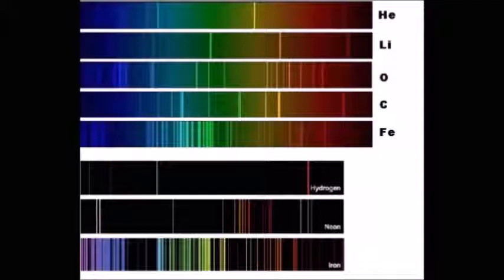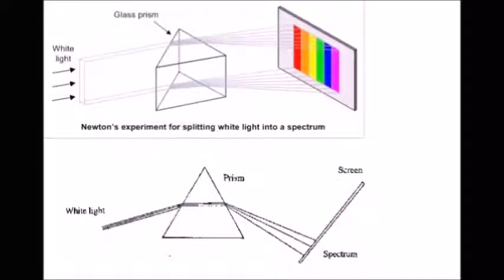Scientists call these frequencies line spectra because they appeared as lines on photographic plates. The simplest way to measure these lines is to use a dispersive element, like a prism or a diffraction grating, which disperses the light emitted from an excited element into its components, and these frequencies will be printed on a photographic plate like an image. These lines are called the spectrum of that specific element.